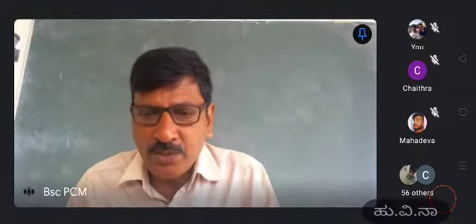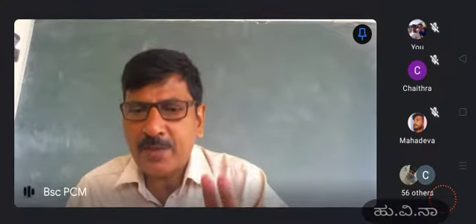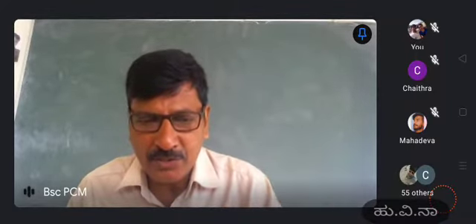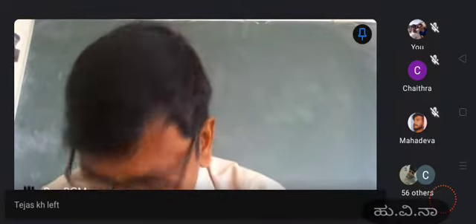NMR. N stands for nuclear, M stands for magnetic, R stands for resonance. So it is nuclear magnetic resonance. You already learned something about spectroscopy. What is spectroscopy? Anybody?